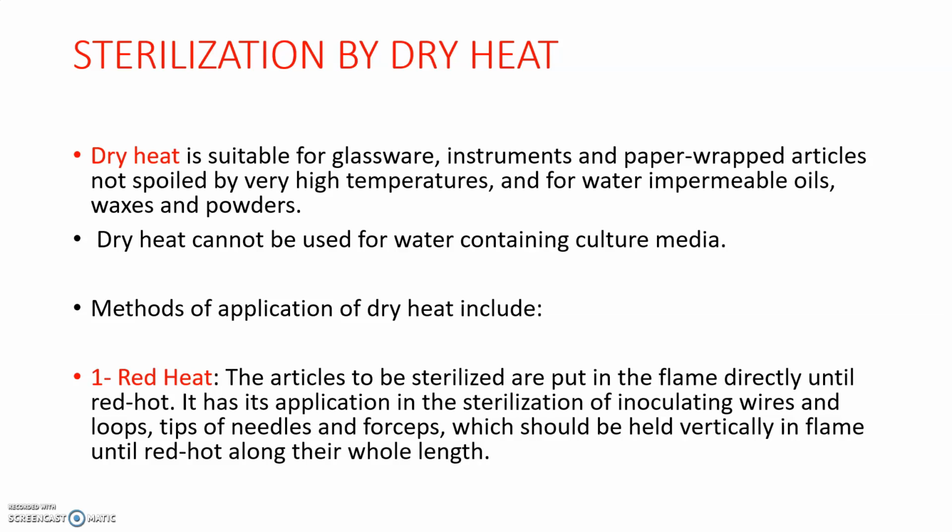Then next is the methods of application of dry heat. How can we apply this dry heat method? What are the different types of application methods which we use in dry heat? Let us discuss. So first one is red heat. The articles to be sterilized.